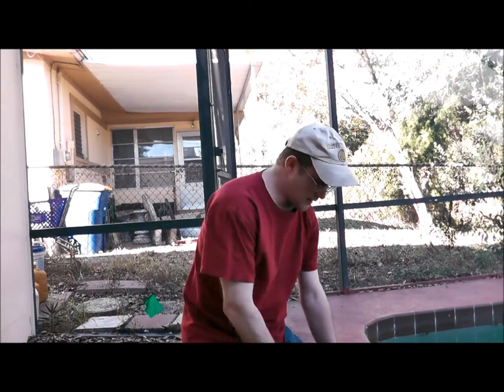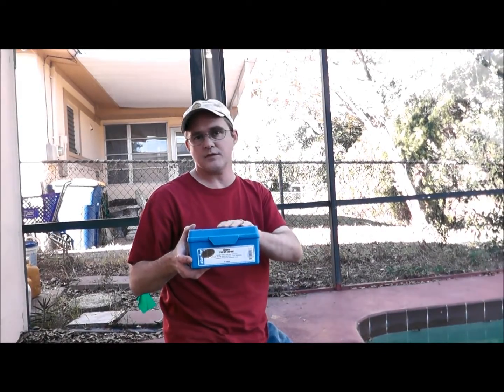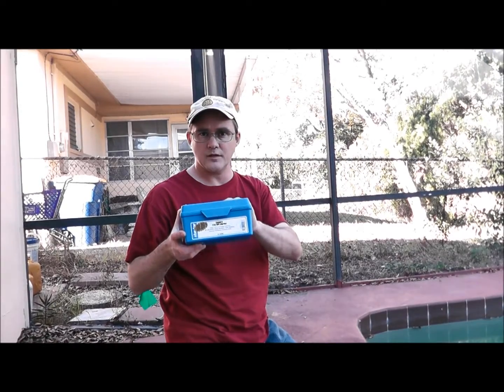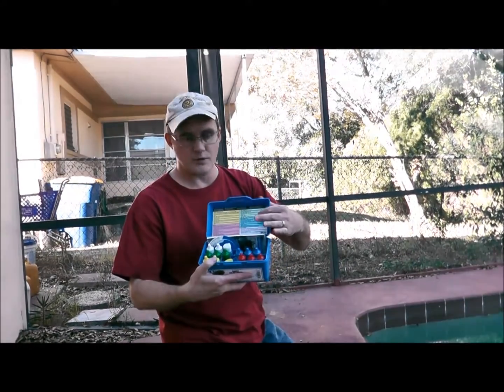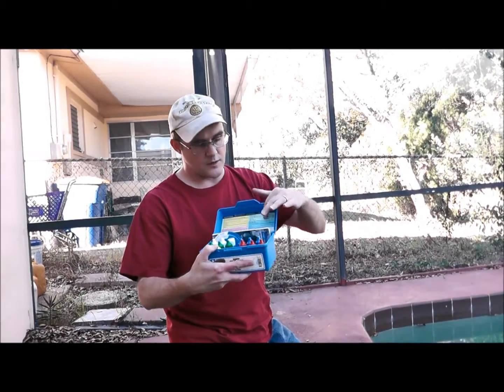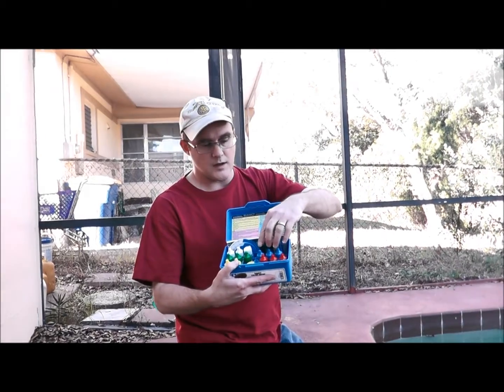Hey, this is Robert with Clean Pool and Spa. In this video I want to teach you how to take your calcium hardness using the K2006 water test kit. If you don't have this, I suggest you get it because it's the most accurate and gives you the actual numbers. Open the kit up — if you get lost or confused, the directions are right on the lid and everything is color-coded with the bottles.